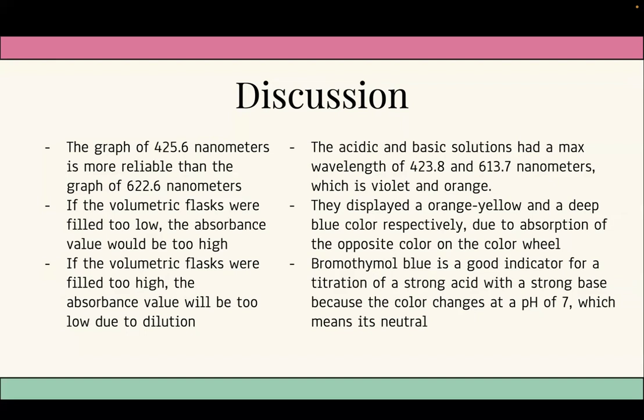We also had to note that if the volumetric flasks were filled too low, then the absorbance value would be too high for those solutions and we would get skewed results. On the opposite hand, if we filled the volumetric flasks too high, then the absorbance value would be too low due to dilution of the solution. This opens up our experiment to error because it's very imperative that we fill the volumetric flasks right up to the mark exactly and make sure that the bottom of the meniscus is lined up with the 5 milliliter mark.